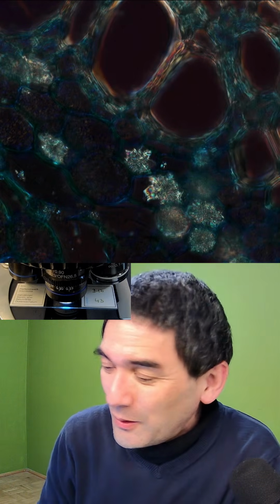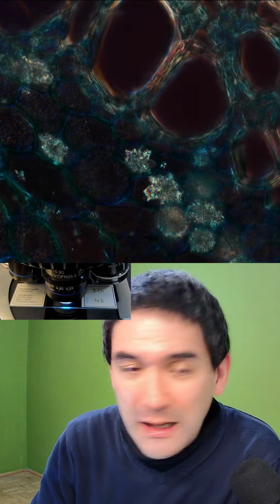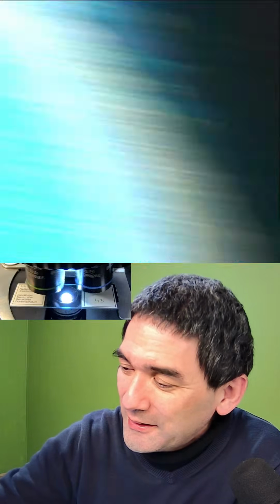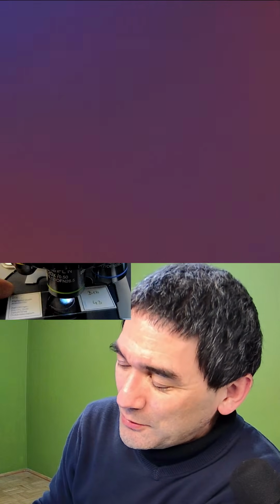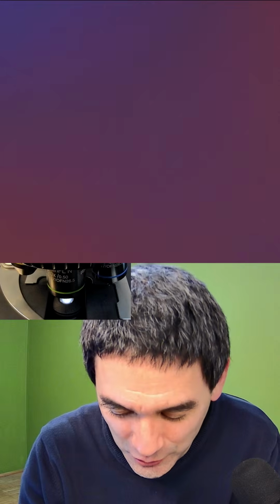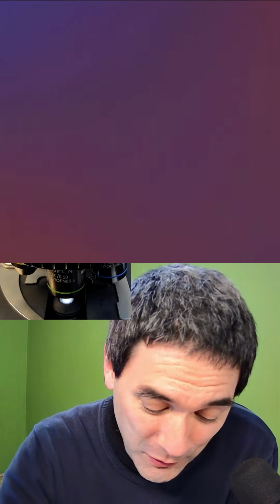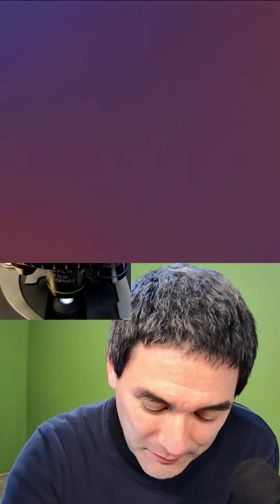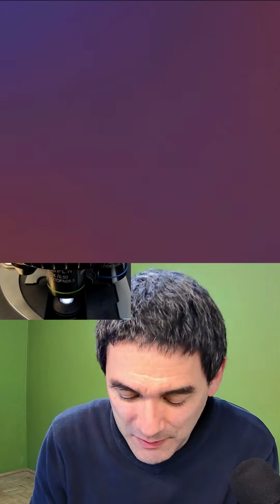So what I do want to show you now is the following. I want to show you some other crystals. A microscopy friend from Germany sent them to me a couple of years ago, and this is something that I really like to share with you. I've also made a video already before that, but I really want to show this to you. He sent me 3 slides. I added the labels. So this was back in 2023.